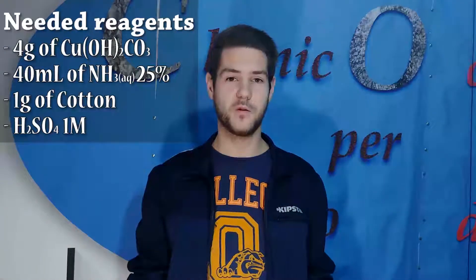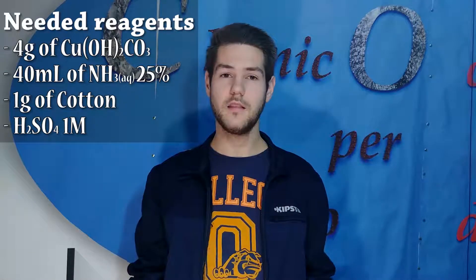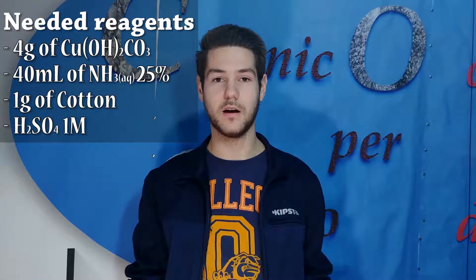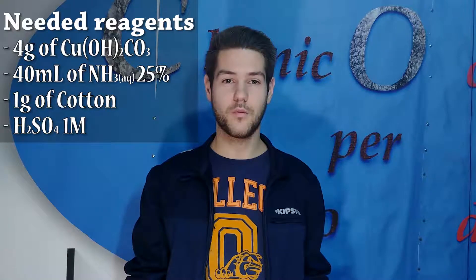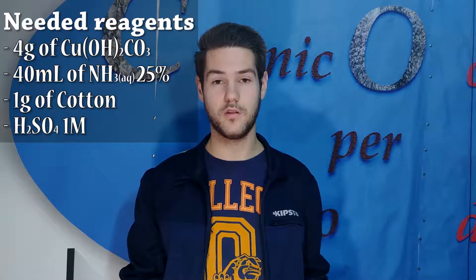The procedure for the experiment consists in firstly weighing 4 grams of basic copper sulfate which we produced, and then we are going to pour 40 milliliters of 25% ammonia. Then we are going to mix the basic copper sulfate with the ammonia, let it react for a while, and then decant this solution because some residue will remain.